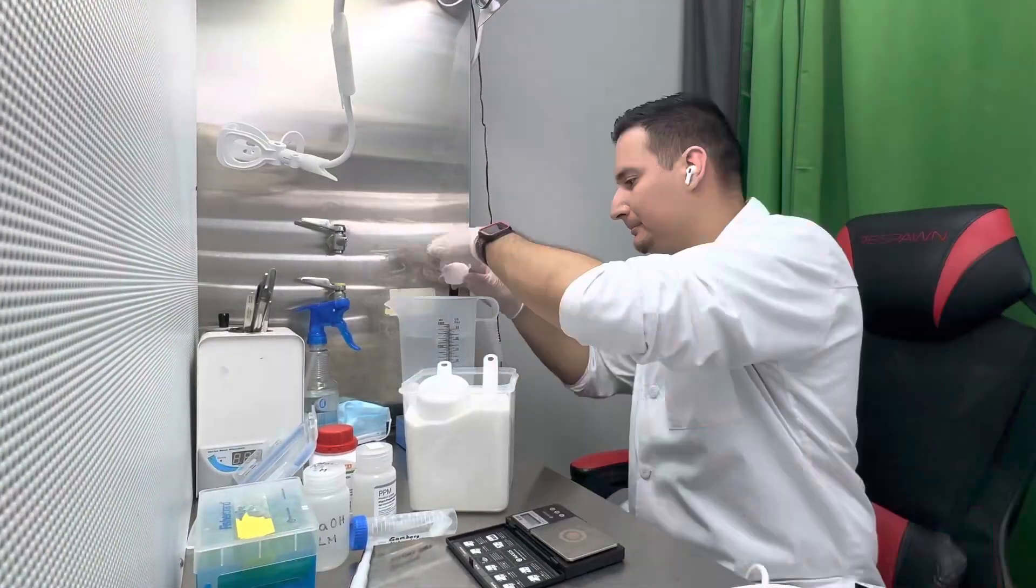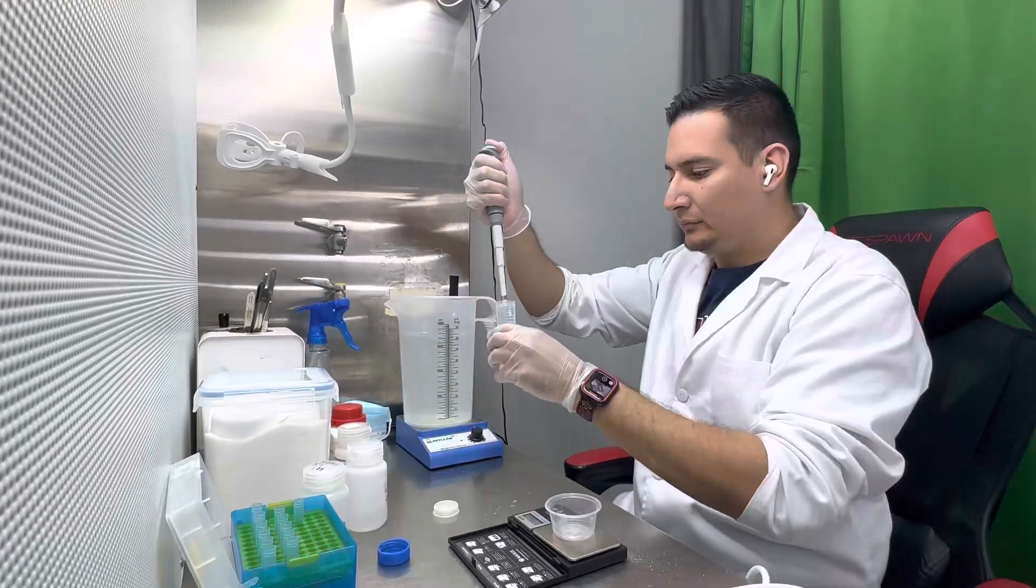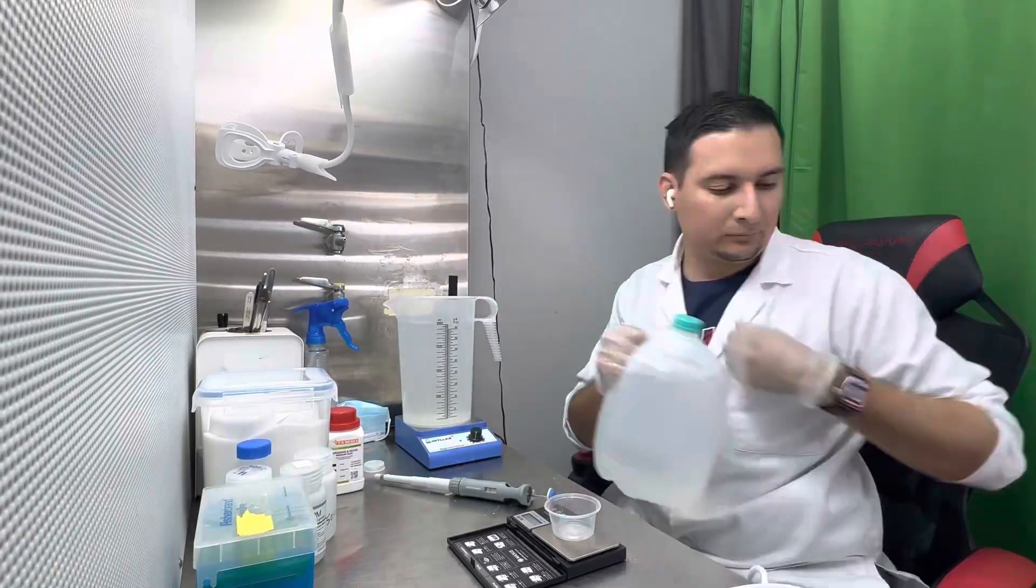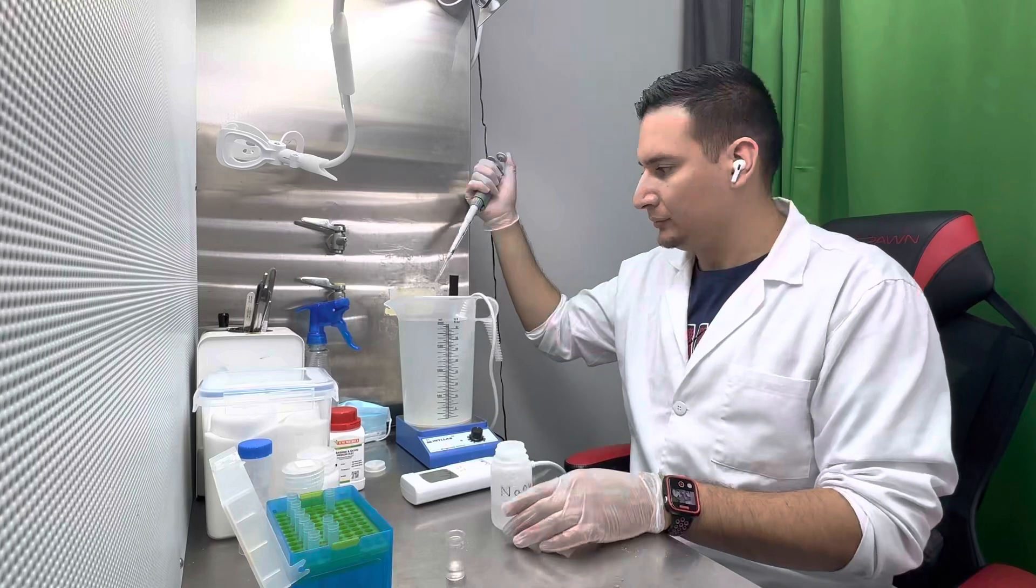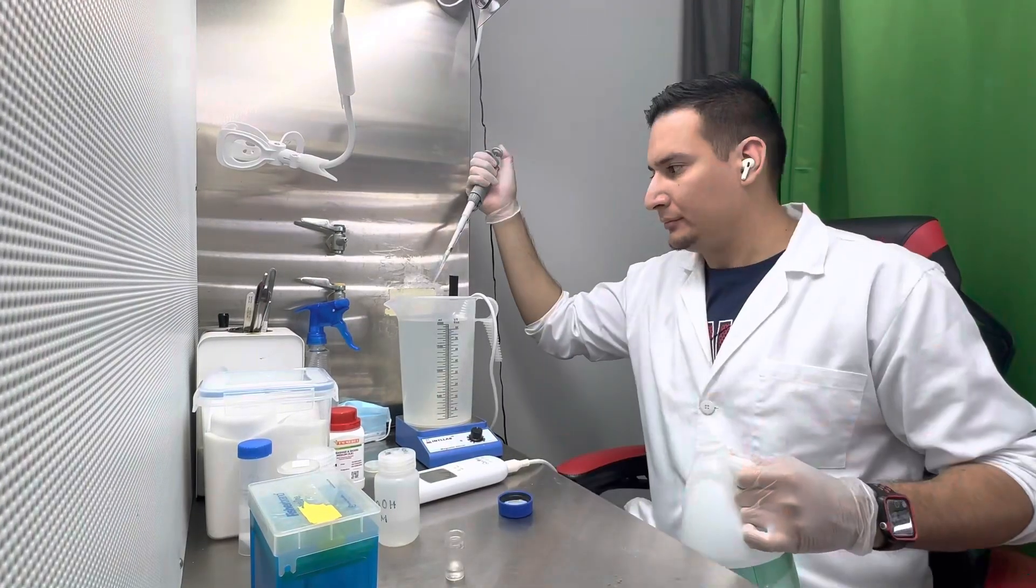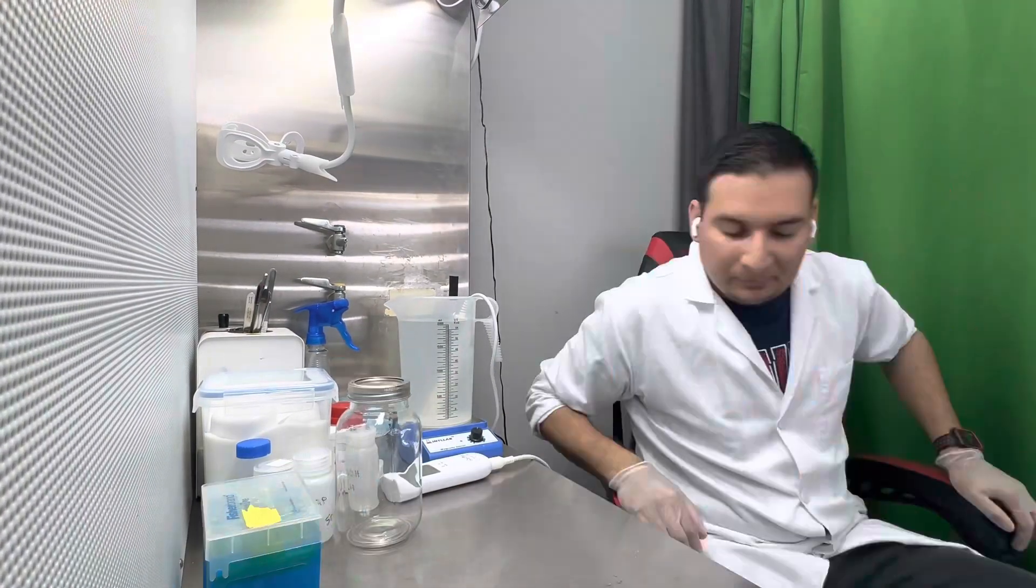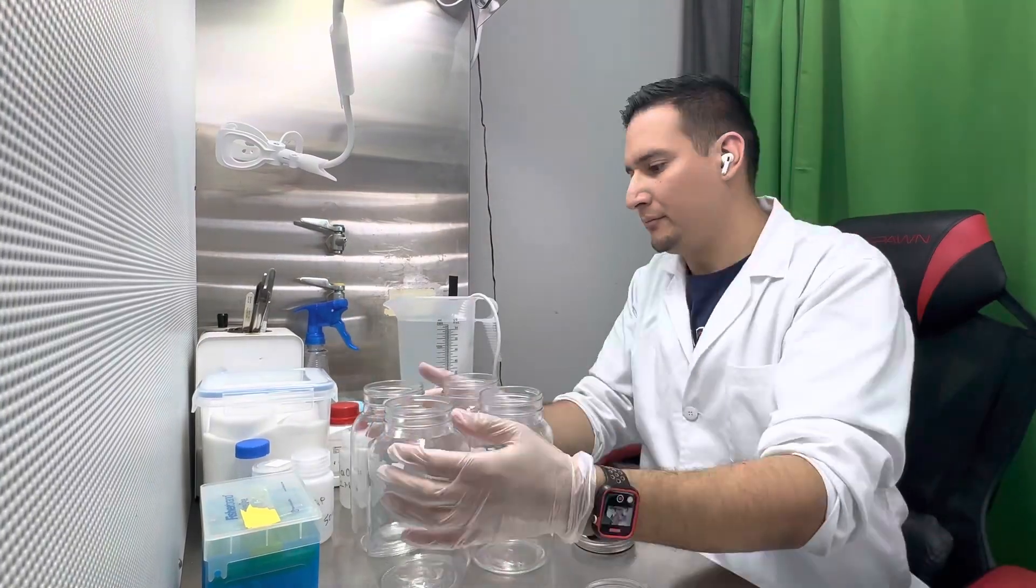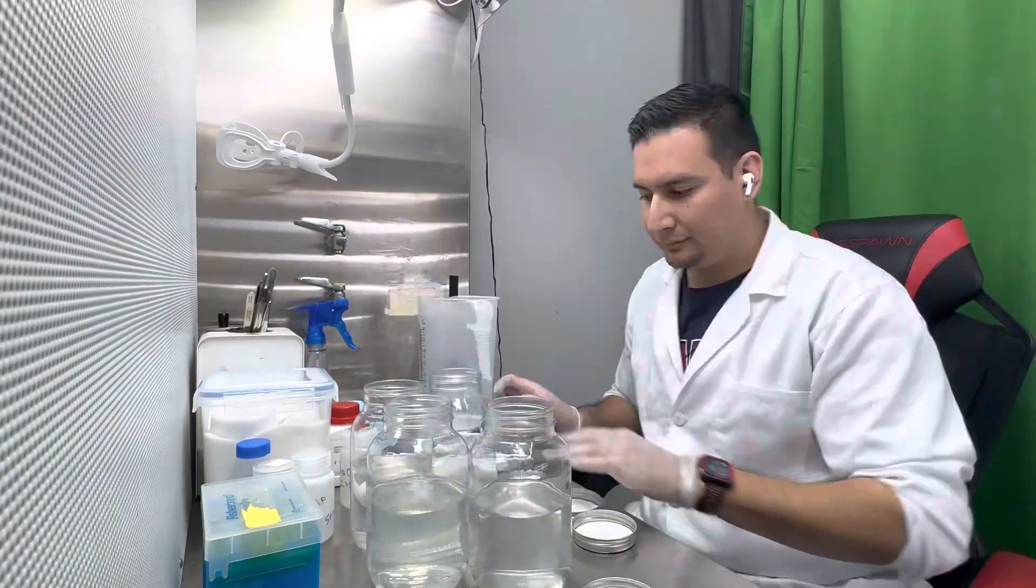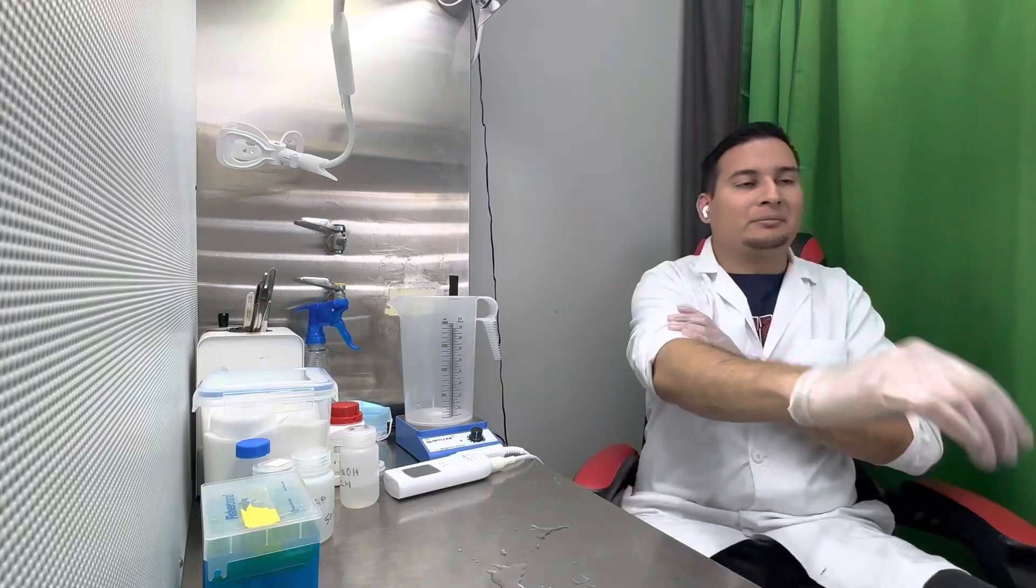Then I have to make media. To make media is very simple—I have other videos on the YouTube channel. I add my MS media, sugar, plant growth regulators, PPM, adjust the pH, and I don't have to use an agar agent as this is a liquid media.